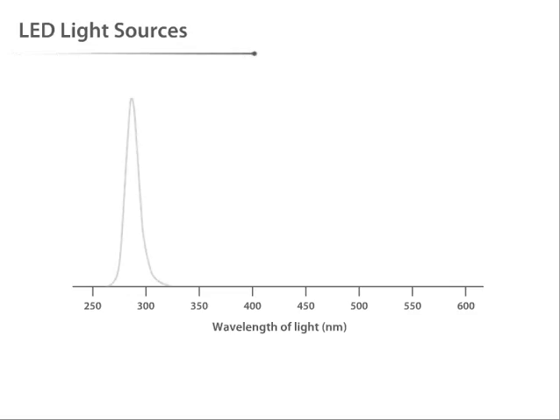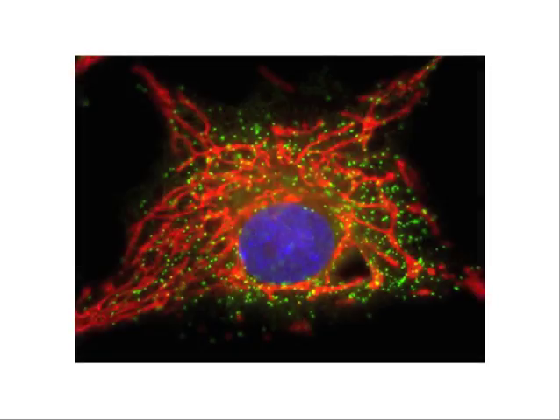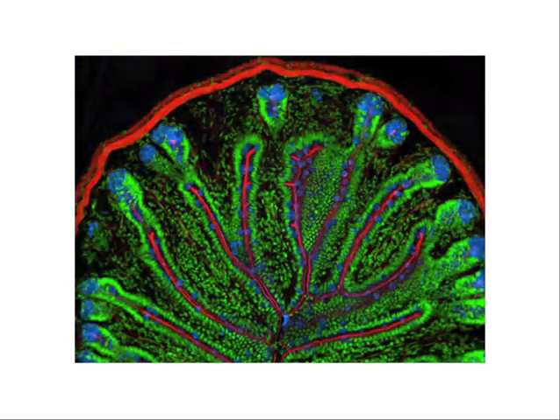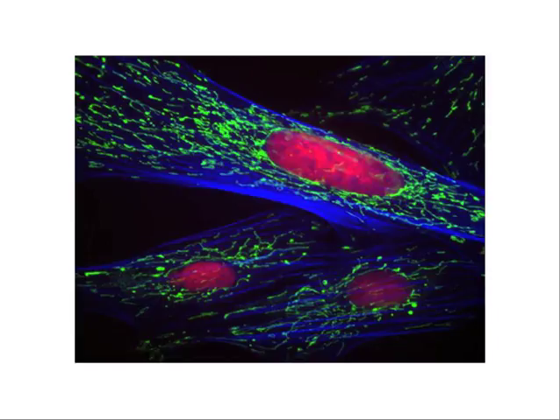LEDs are relatively new light sources for fluorescence excitation. Single-color LEDs are ideal for low-cost instrumentation where they can be combined with simple long-pass filters that block the LED excitation and allow the transmission of the dye signal. There are many options for light sources for fluorescence. Selecting the appropriate light source and filters for both excitation and emission can increase the sensitivity of signal detection to an astounding degree, making fluorescence labeling one of the most sensitive detection technologies available.